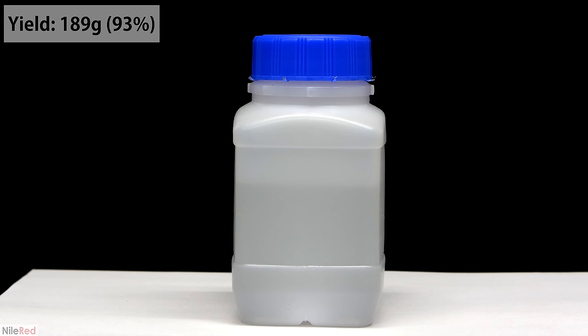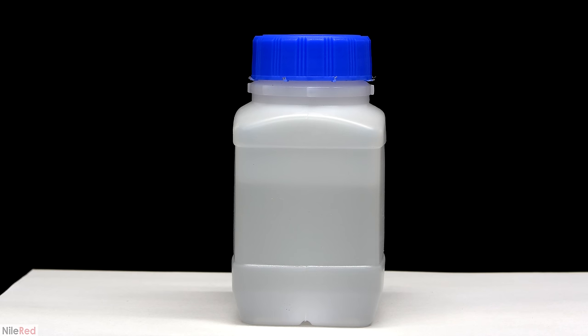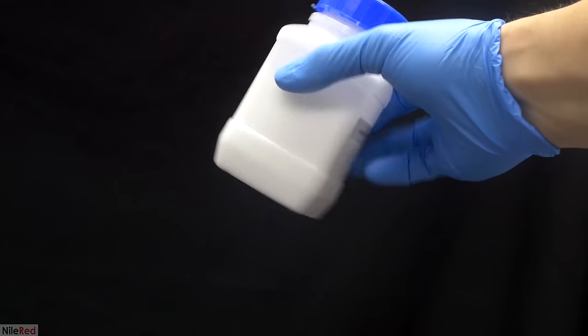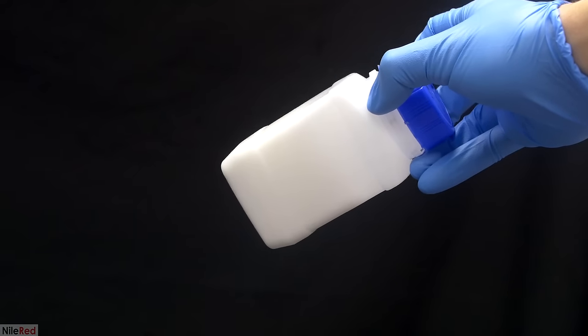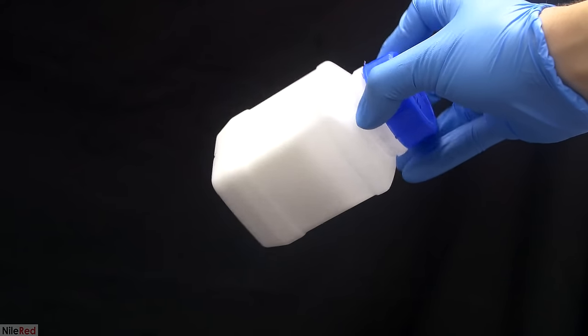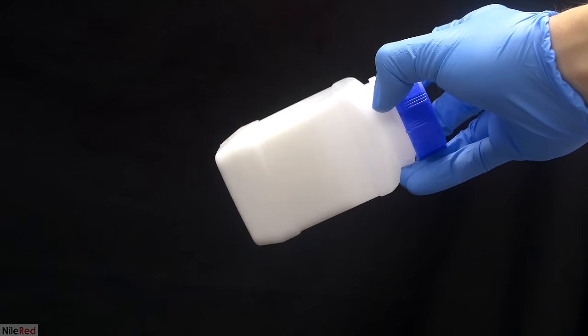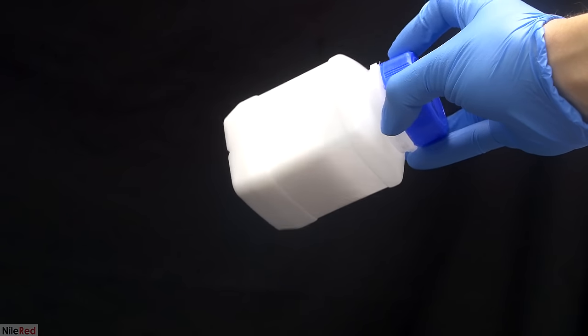As I said before, this aluminum isopropoxide is going to be used to make 1-octen-3-ol. Other than that, I don't really have any plans for it, so if you guys have any good suggestions, please leave them in the comments. Just as a quick side note, it took a few days or a week, but the isopropoxide did eventually solidify. Anyway, that's all I have to say for now, and I'll see you guys on the next one.